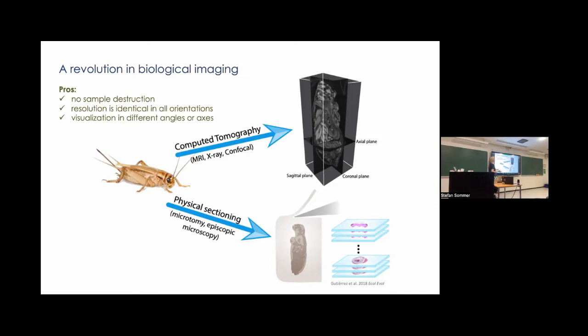And we all know the pros of this, right? It's non-destructive. You get the same resolution in all orientations, which you don't with, for example, microscopy. And then you can spin this thing around, right? You can rotate it to look at different angles.